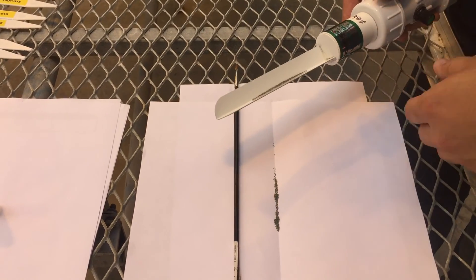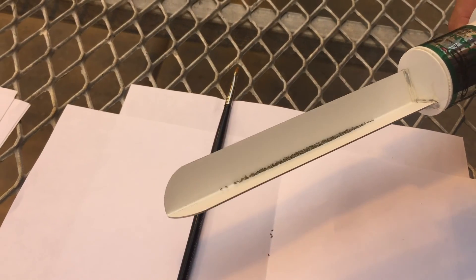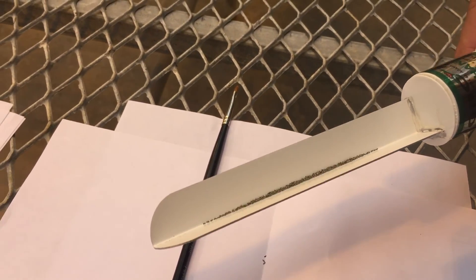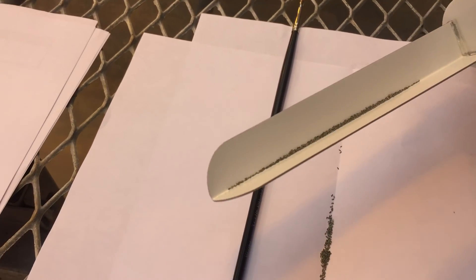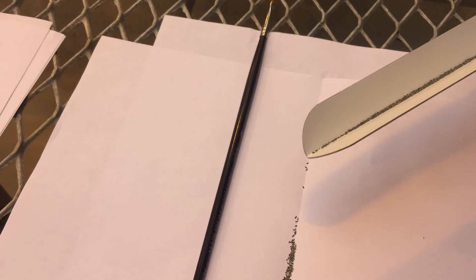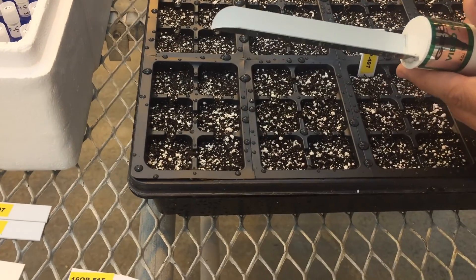To sow the seeds, we use this vibrating seed sowing machine called the Vibro Hand Seeder from Grow More. When you push the button, it vibrates that V-shaped trough, and the seeds come out one by one on the tip, making it very easy to sow one seed at a time in our trays.